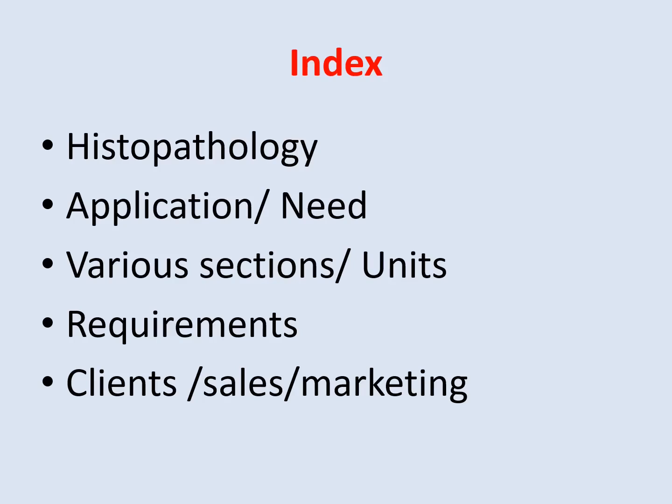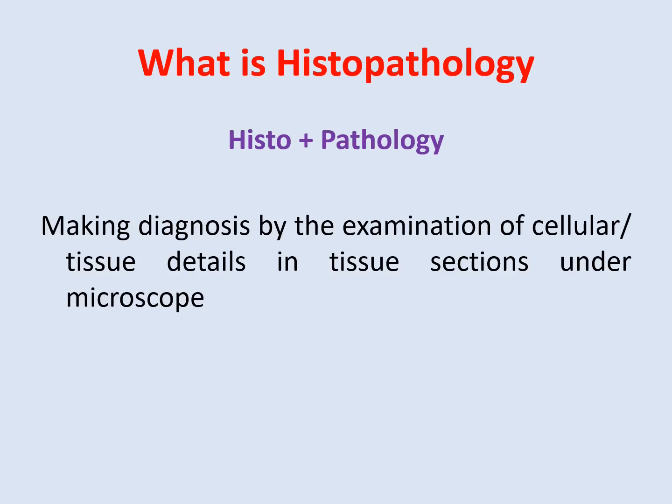The topic has been covered under subheadings: what is histopathology, what are its applications, what is the need of this technique, what are the various sections or units which we have to make, and what are the requirements of a particular section, who are the clients, and what is the strategy of sales and marketing.